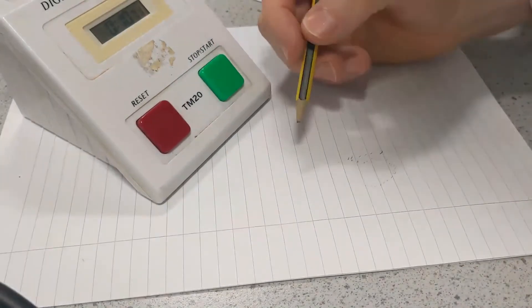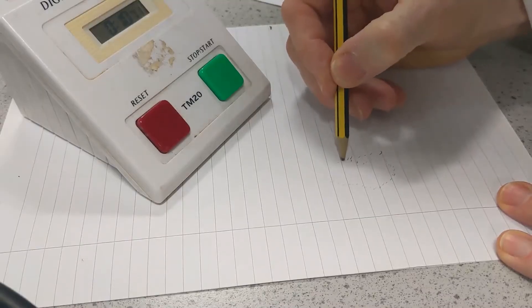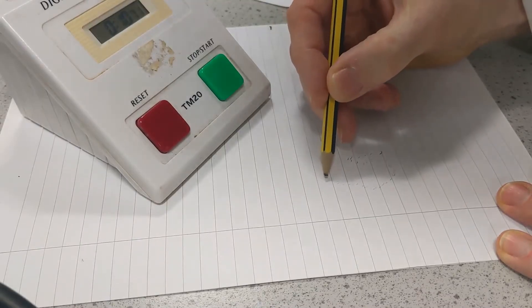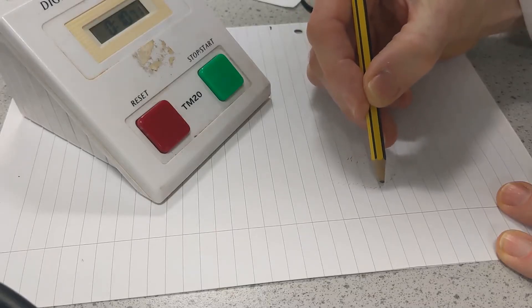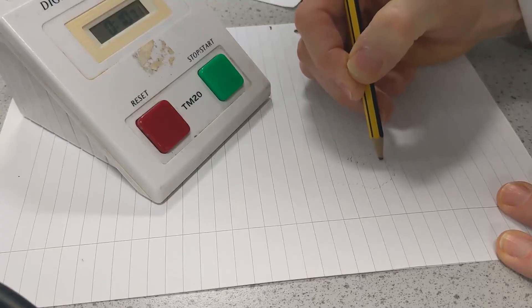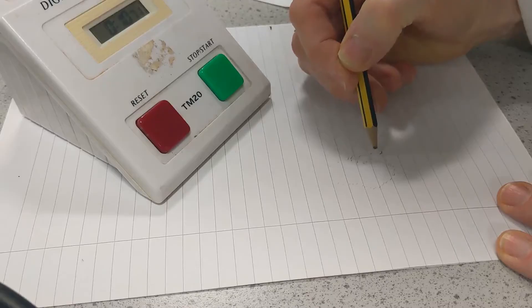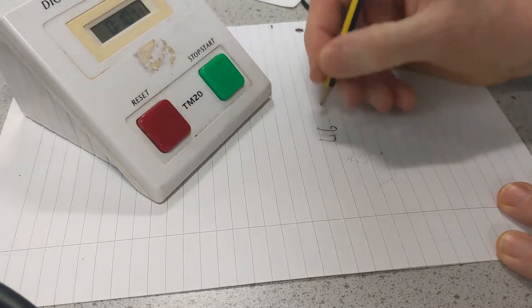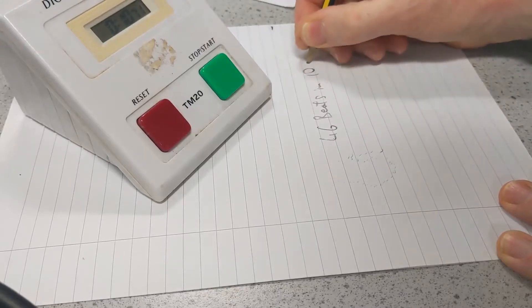Now I need to count up these dots and see how many beats there were: 1, 2, 3, 4, 5, 6, 7, 8, 9, 10, 11, 12, 13, 14, 15, 16, 17, 18, 19, 20, 21, 22, 23, 24, 25, 26, 27, 28, 29 — 40, 41, 42, 43, 44, 45, 46. That's 46 beats in 10 seconds.